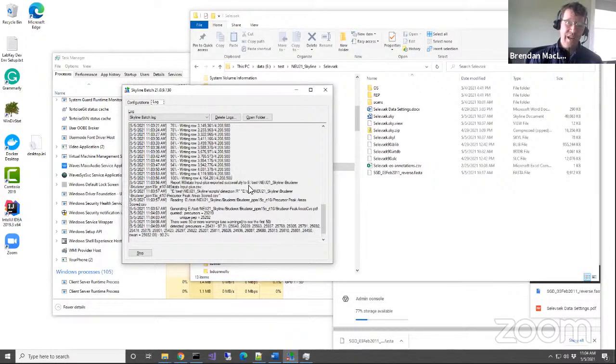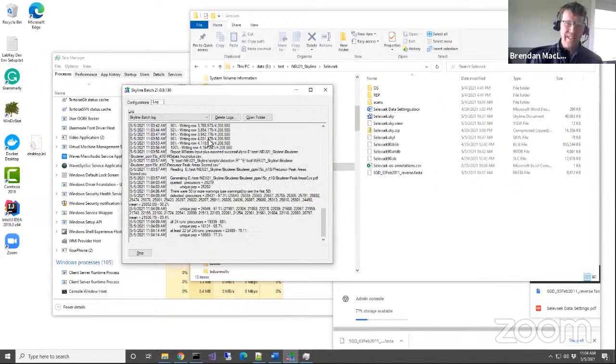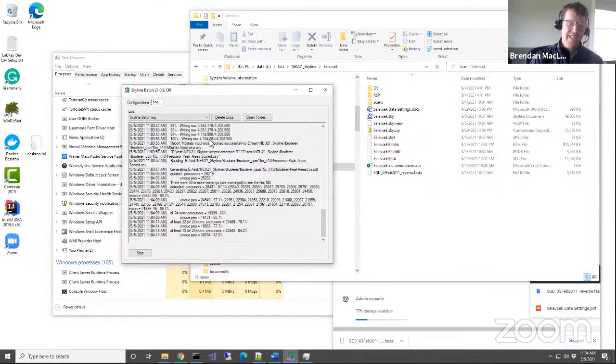I know that Spectronaut also has a report format. Just like we're exporting this special report for MS Stats, Skyline has incredibly flexible reports, and anybody can save and share a report template with you.